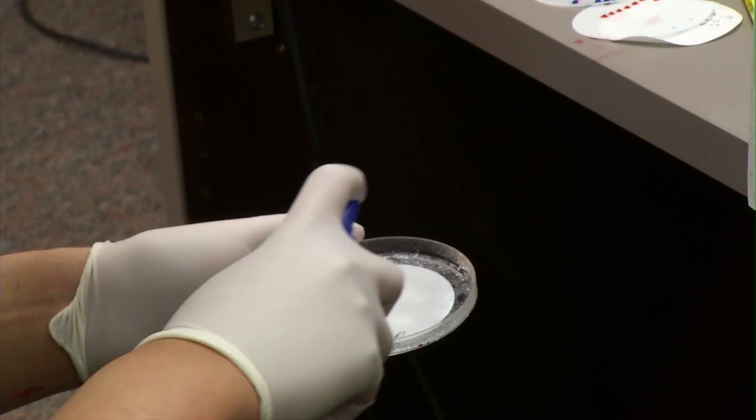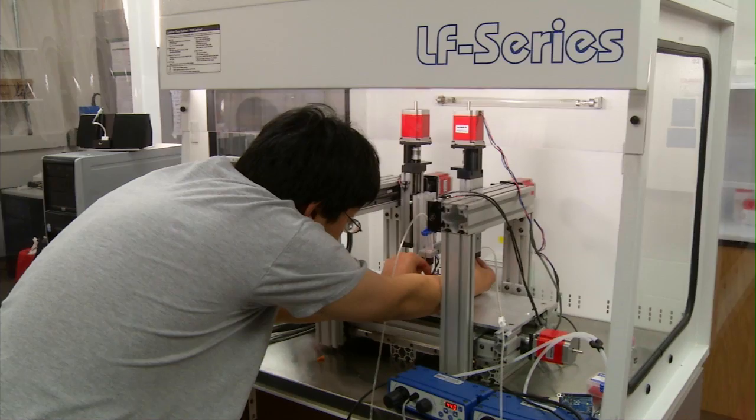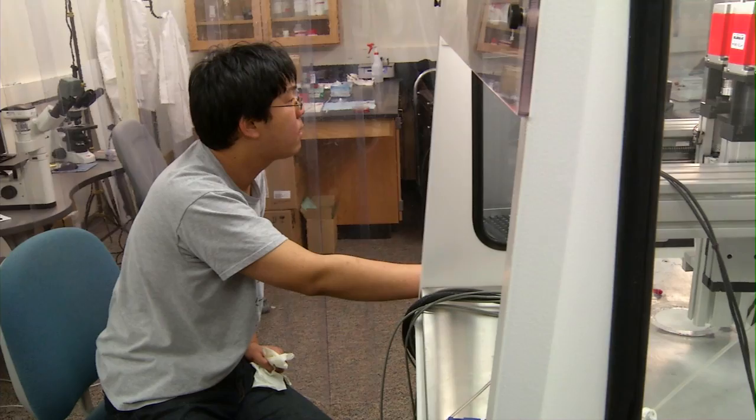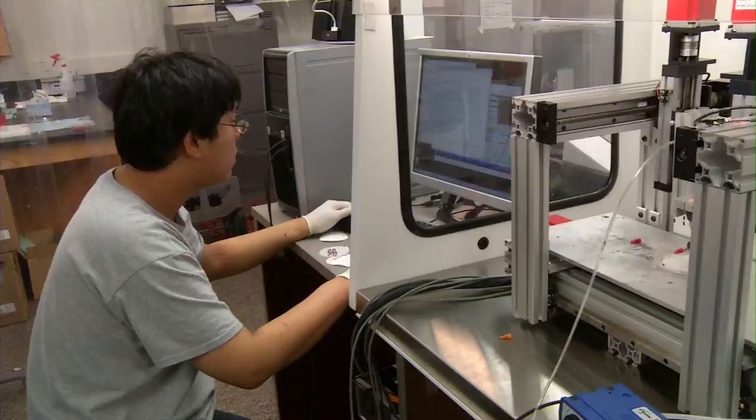This bioprinting, organ printing field is pretty new. I'm just doing something that people have never done before. Another doctoral student, Howard Chen, built the machine responsible for the bioprinting. His background is mechanical and industrial engineering, and he designed the robotics and software that prints the living structures. We want to print two different materials and we want to do it concurrently to minimize fabrication time. Each one of these systems is well established on how it works on its own, but the challenge is getting these two systems to work together concurrently without getting in each other's way. That is where a lot of the research lies.